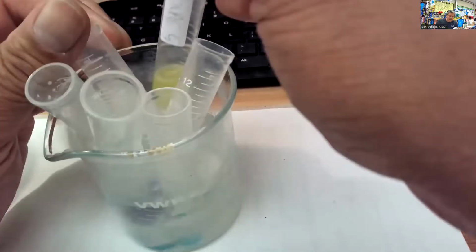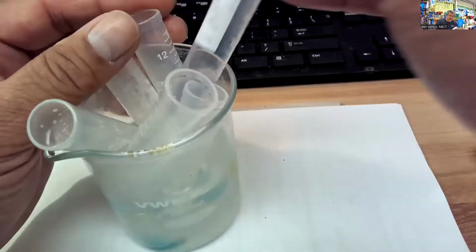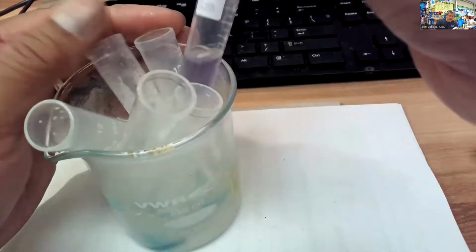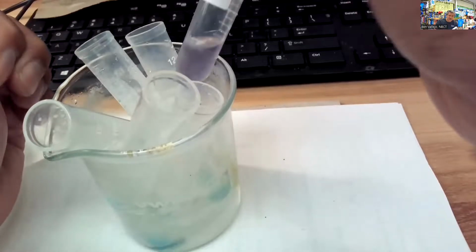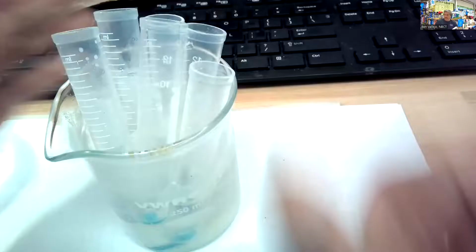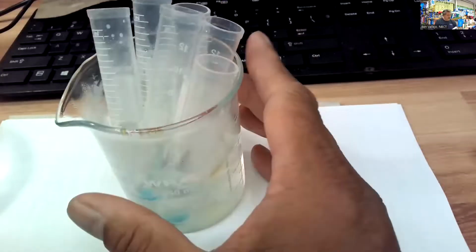And already I can say, whoa, it's definitely a different color. And what about the unknown? Did the unknown have a yellow, orange, or a red? In this case, no. Okay. So we'll let that run a little bit. But that is basically our lab.